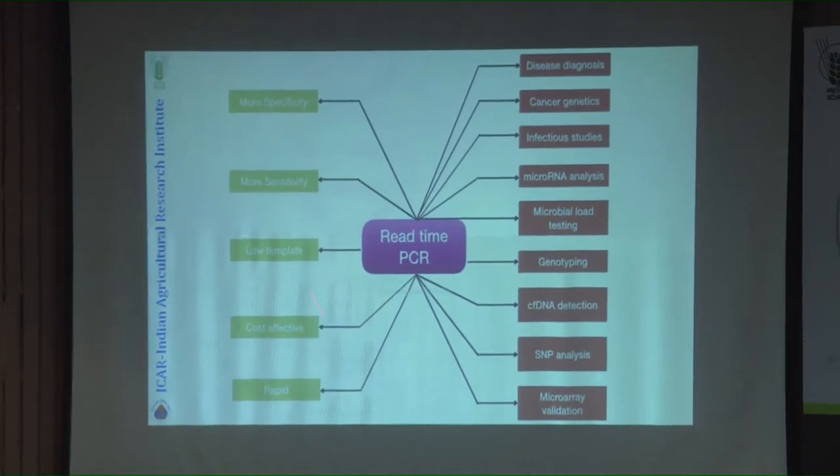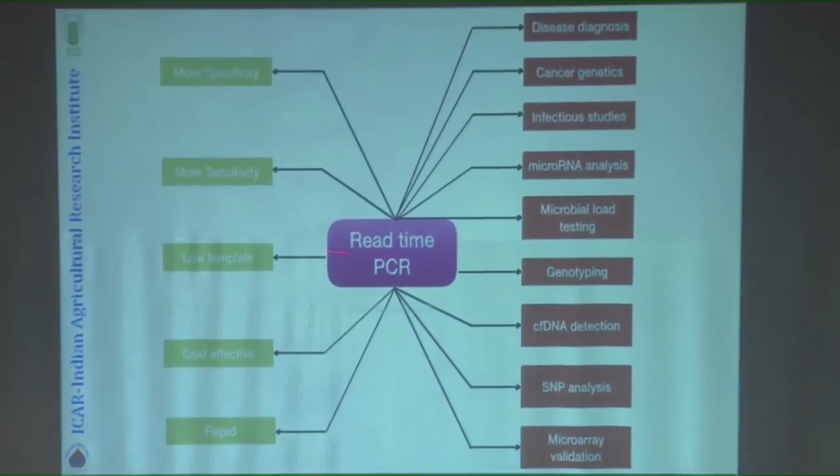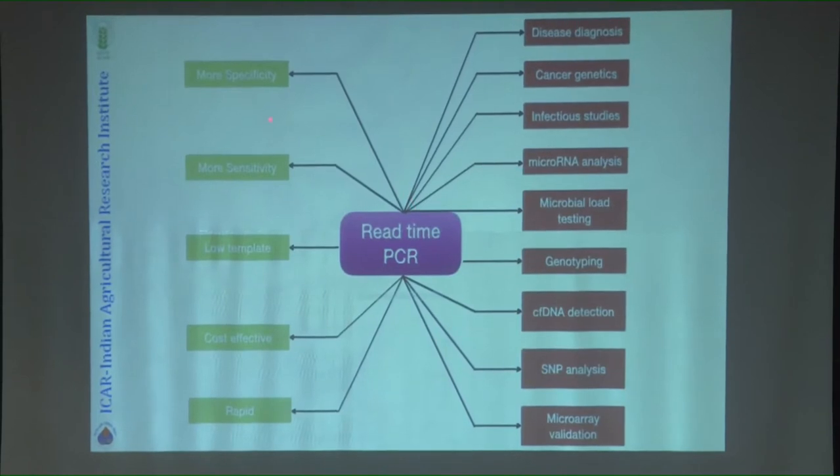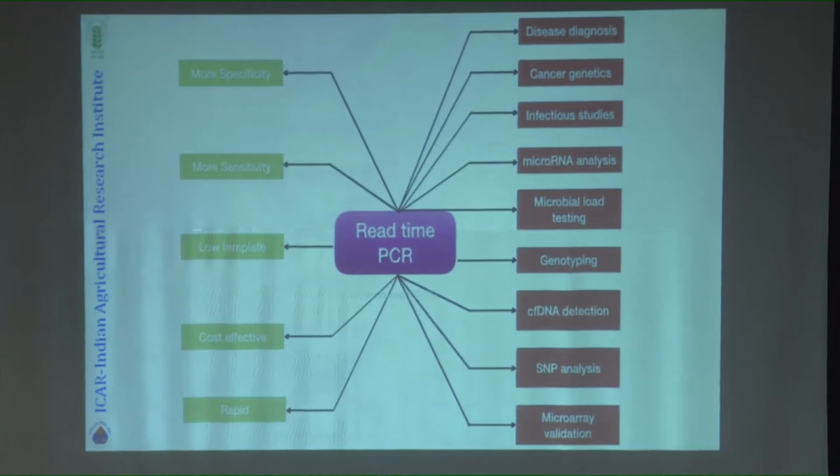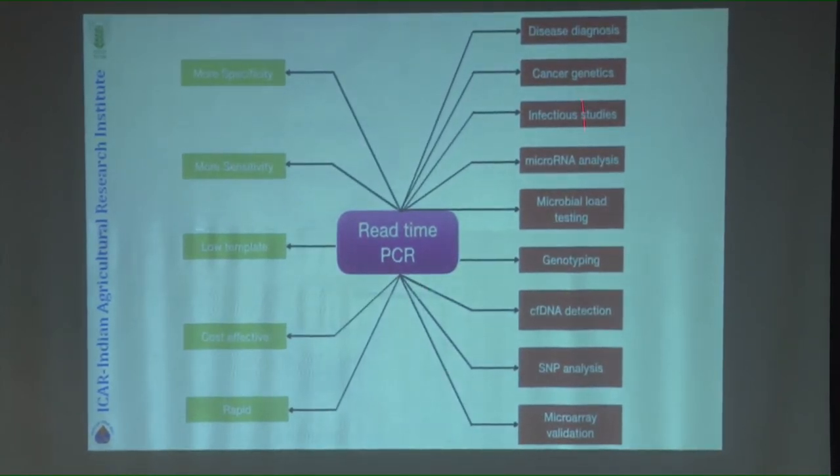Well, so it's real-time PCR or qPCR. Depending on the kind of experiment you want to do, you can apply this in several ways. All these things are listed out because going through each one of them is something different. As you appreciate, since PCR was introduced, we have so many variants in PCR machines or types of PCR used to amplify, because each one has difficulties in amplification.